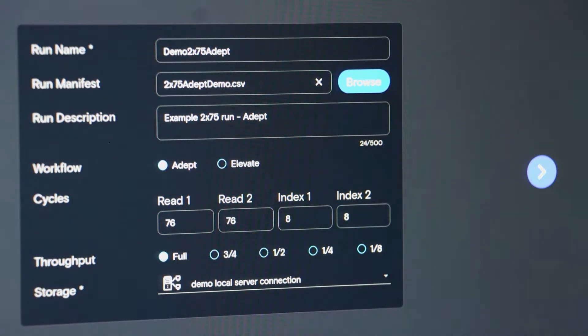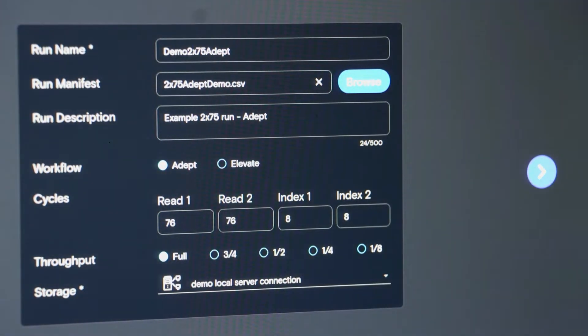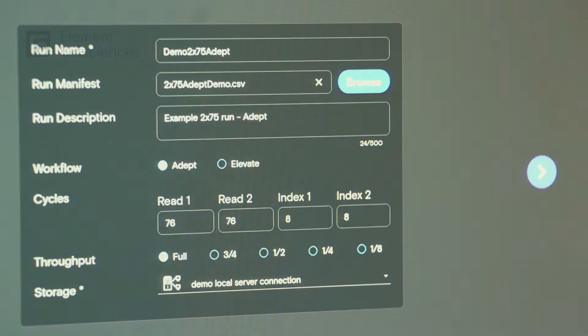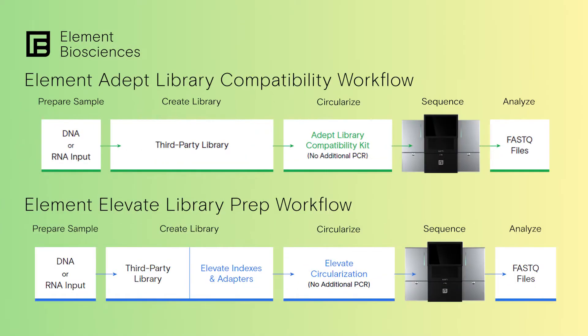In this case, we are using the 2x75 ADEPT file. Now recall that the Aviti system provides two very simple options for the library preparation. We call them the ADEPT and elevate workflows.